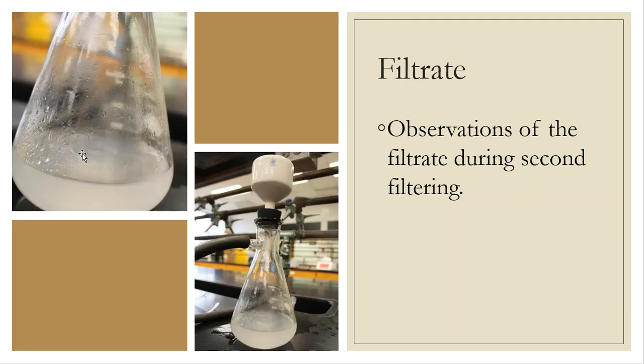One more time, I look at this filter flask, and this is what I see. Now, I know what you're thinking. Oh my God, he's going to have to do it again. Well, no, not necessarily. The reason that I did not filter this again is because I didn't see any solid. Now, I saw cloudiness, and that's okay, but I did not see any solid formation. I saw solid formation the last time. That's why I had precipitate. That's why I had to refilter, because I needed that precipitate. This stayed as a liquid, and that's okay.